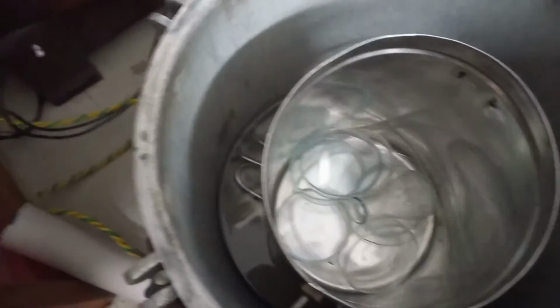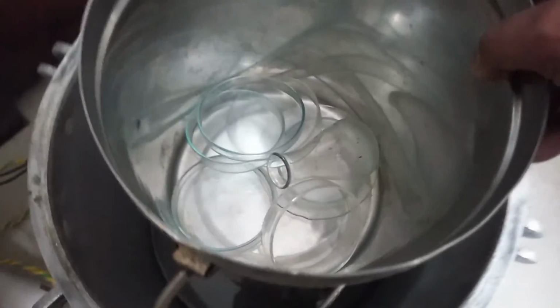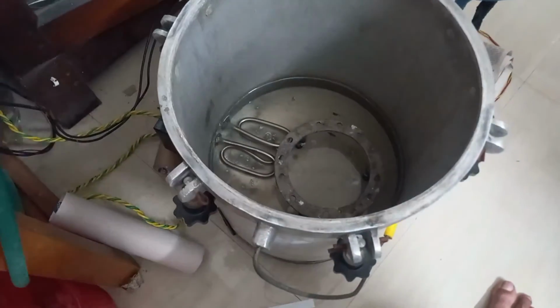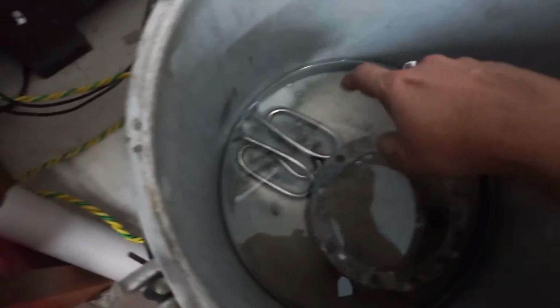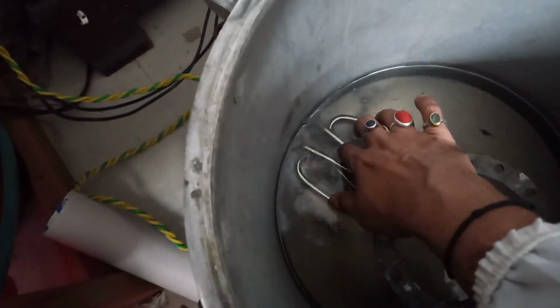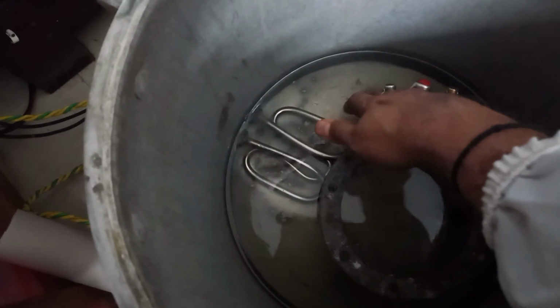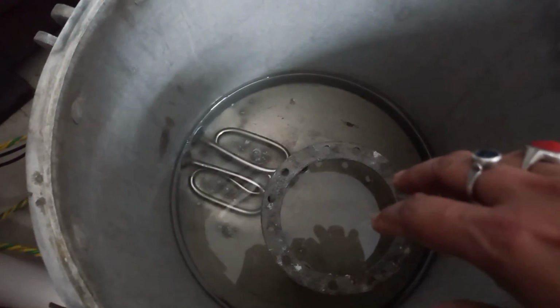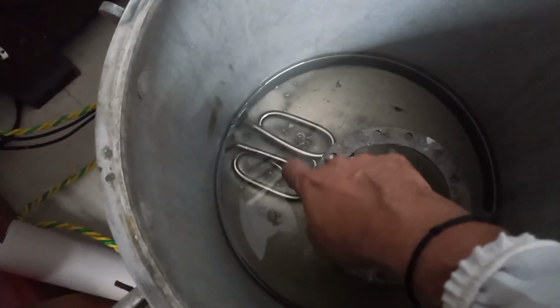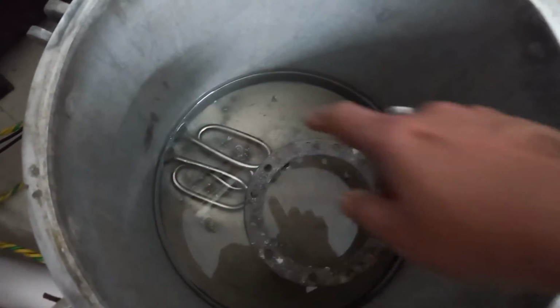If I take up the can in which I have kept all my glass apparatus, you can see inside. This is the heater, and you can see the water there. This is distilled water, and the inside chamber is very clean, and this is the stool on which the can is kept.